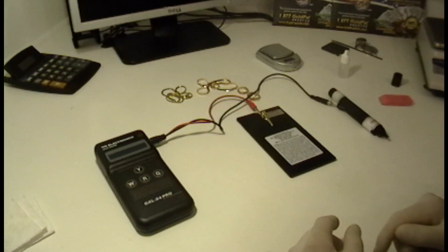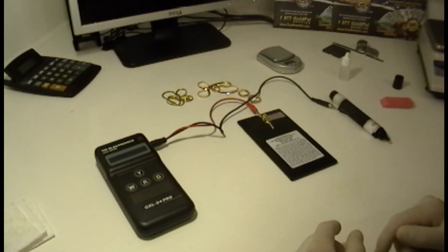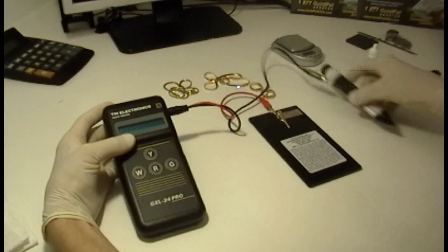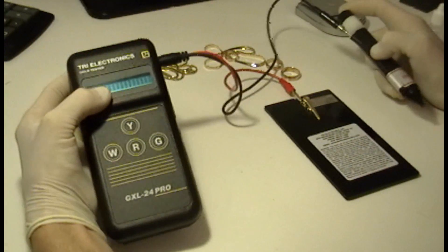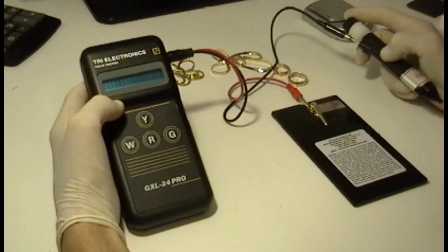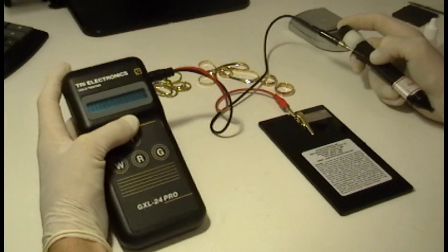Hello and welcome to Goldpal Tutorials. This time we're going to test gold using the electronic tester. This is a very simple way to test gold, well if you have the machine. This machine is the most common, the most widely used by the industry and is very accurate.